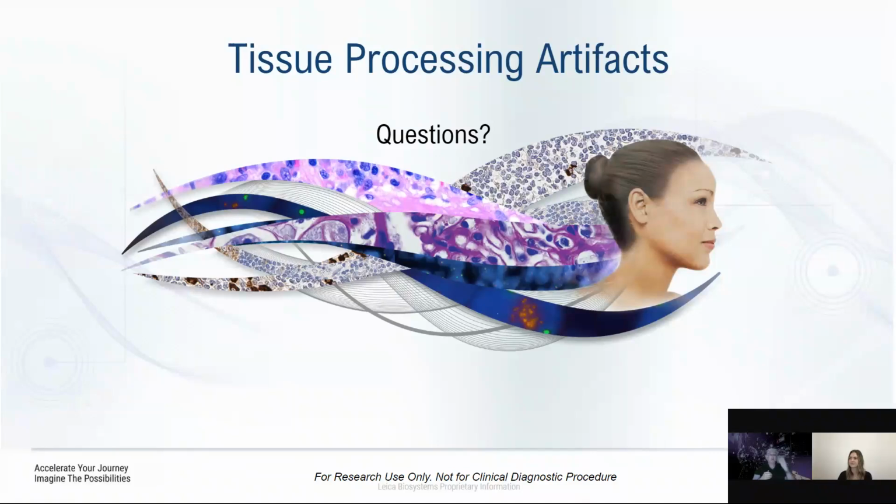When you're on the microtome, it depends on what you're targeting. If you're targeting just normal H&E, IHC stuff, then you're going to cut anywhere from 4 to 5 microns. If you're doing lymph nodes, they're a little more densely cellular, or spleen, you're going to cut sections at about 3 to 4 microns. It does create a challenge for those that don't cut all the time on a microtome. It's an art, right? Some days more of an art than a skill. So 3 to 4 for those really heavy lymph nodes and spleens that are very dense with cells, and everything else is pretty much 4 to 5.